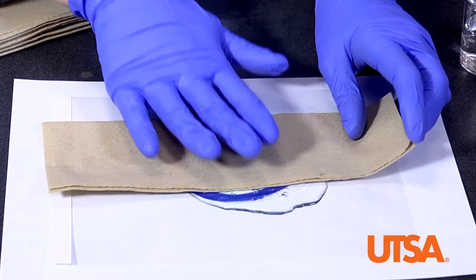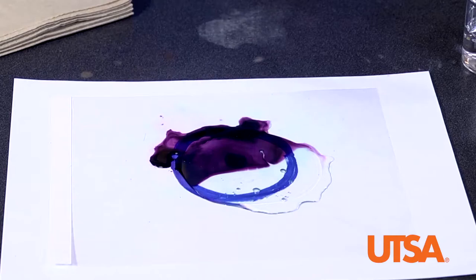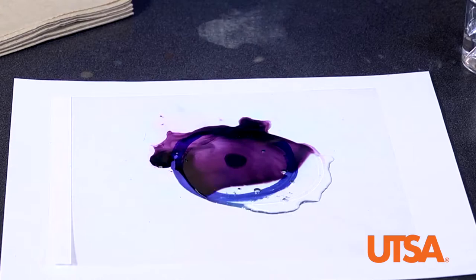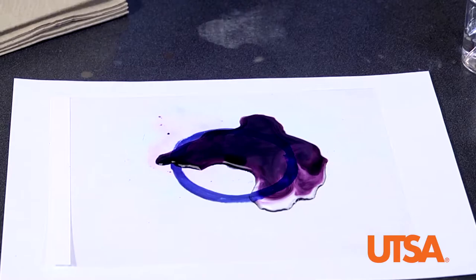You may allow students to suggest how to get the color out from beneath the contact lens. This may include blotting with a paper towel, rinsing with more water, and removing the contact and repeating the above. Guide students through a discussion on how much time it takes to remove the color from the eye, and discuss how important it is to get any compound out of your eye as quickly as possible to prevent long-term damage.